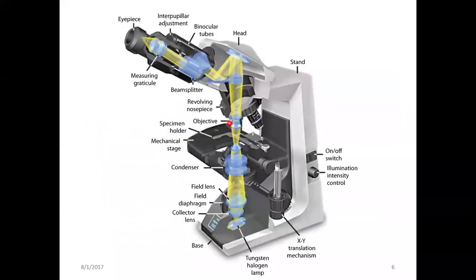Okay. So guys, we have here the parts of our microscope. So these are the basic parts. What I want you to do is, of course, to get a copy of this. You can actually get different pictures coming from the internet. So please memorize the different parts, especially the most common or the basic parts, and of course their functions. Okay, and of course for you to have a practice or a simulation of microscopy technique, you can click the link. Or kung ayaw nyo namang gawin ngayon, you can actually visit the same link doon po sa inyong microscopy simulation section sa inyong online module.